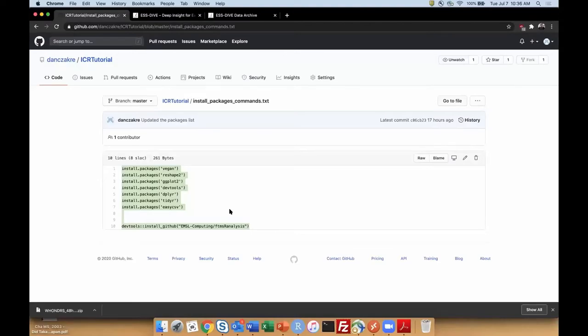And that's just one of the, I don't want to say downsides, but one of the limitations of FTICRMS. But that being said, even though you can't assign formulas to all of the masses, you still get 3,000 molecular formulas in a sample. That's still pretty robust, and more sometimes.